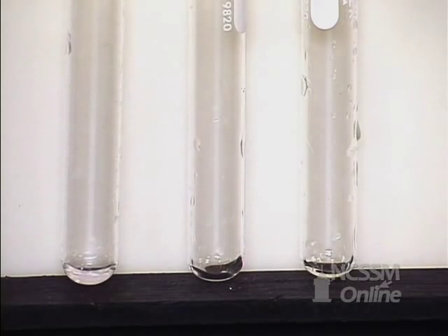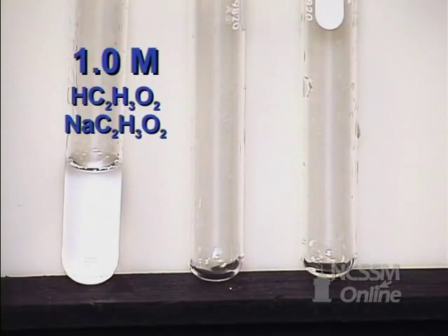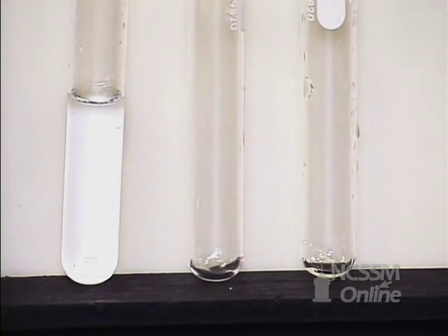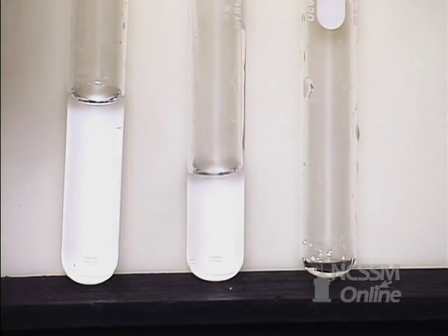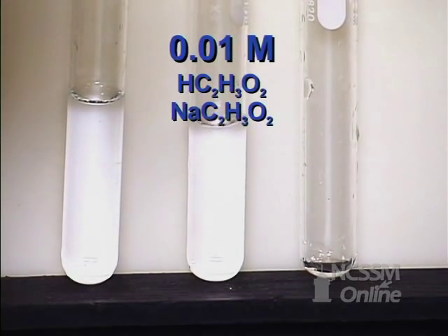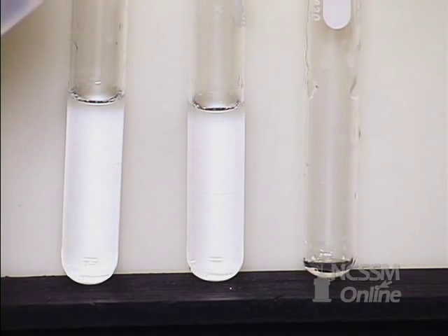In the first test tube, I'm going to put 1.0 molar acetic acid sodium acetate buffer. In the second test tube, I'm going to put the same buffer but a different concentration. This is a 0.01 molar buffer made from acetic acid and sodium acetate.